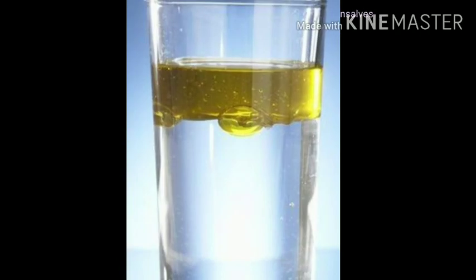When you take the organic solvent, care should be taken that it should be immiscible with the aqueous solution. Immiscible means the two solutions should not mix, which means it is going to result in the formation of two separate layers. When vigorous mixing is done, the solute gets distributed between the two immiscible liquids. The organic substance is extracted or separated based on the difference in the solubilities. Let us now watch one more video on solvent extraction.